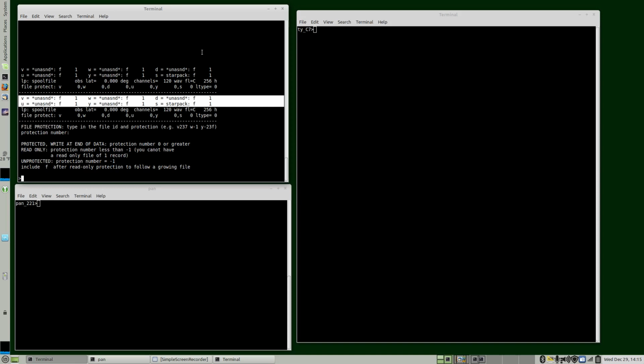So you can have more, just that if you want your histories to work out so you can find things, then limit your files to 1 million spectra. And in practice, we've never even come close to that. So for example, on PAN, if we did the Spec Find minus E, we have 400,000 spectra, and that's spread across quite a few different files.